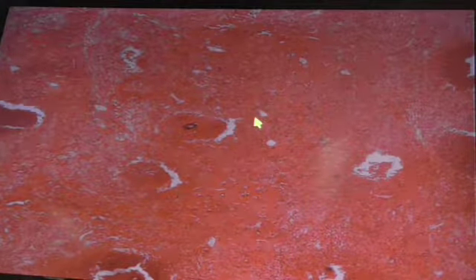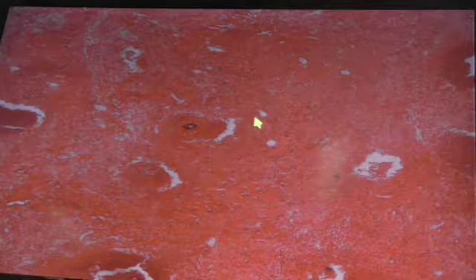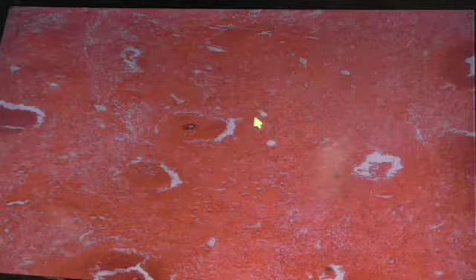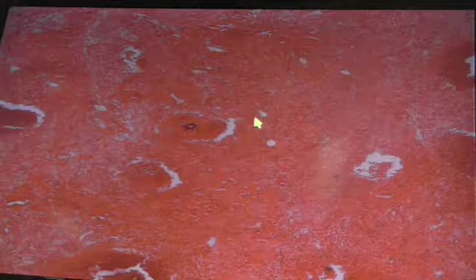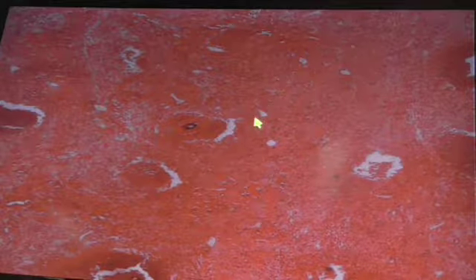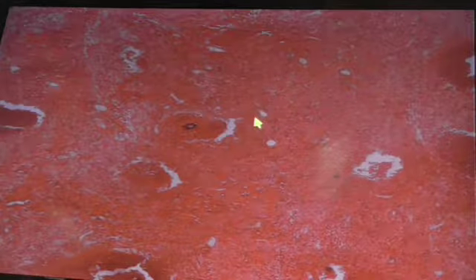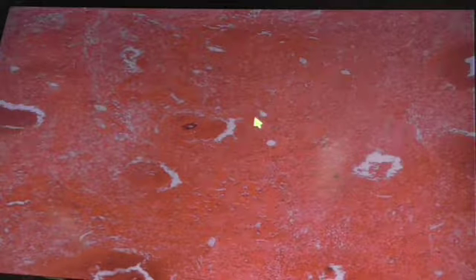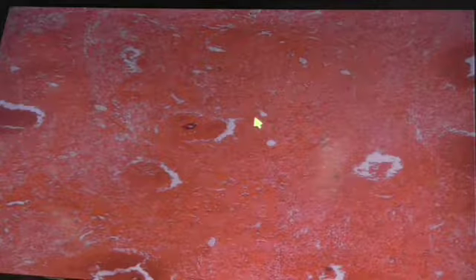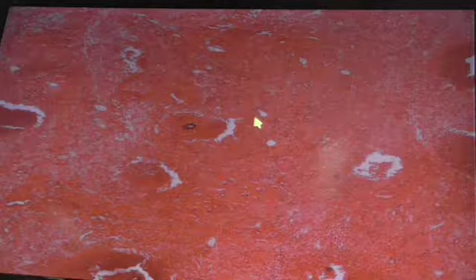So you probably get that with, let's say, E. coli or with streptococcal type of bacteria. But something like Actinomyces, which is what this one is, right? So Actinomyces bovis, lumpy jaw, this is what this particular disease entity was. Okay, so again, you can use a Gram stain, culture and sensitivity for that one as well.